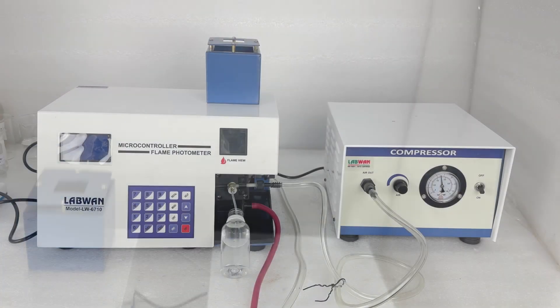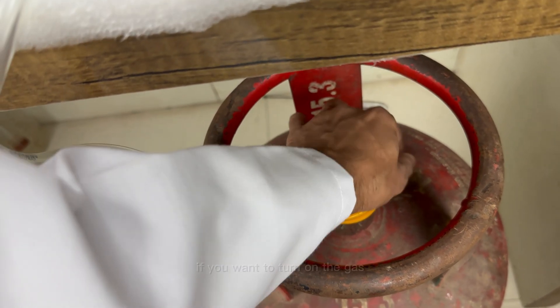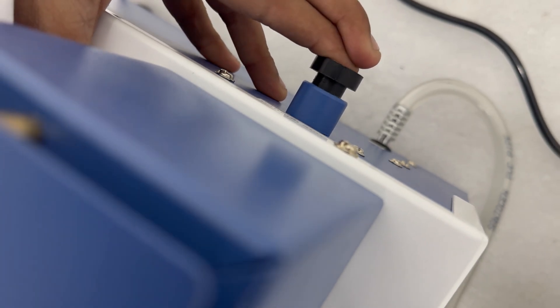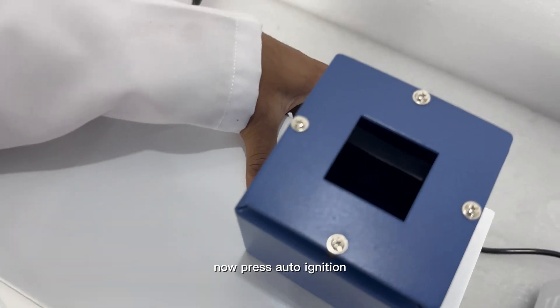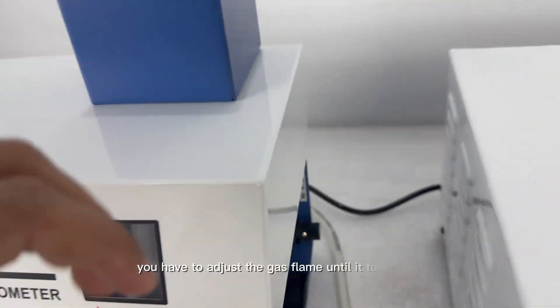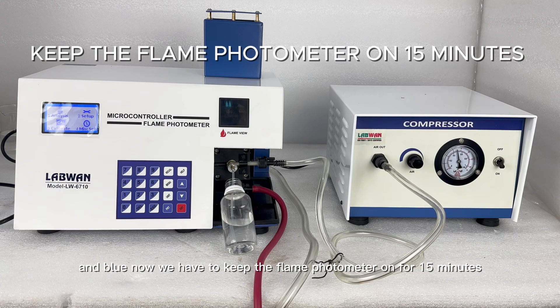Now turn on the device. To turn on the gas, use the auto-ignition by pressing it. Now turn on the gas, and you can adjust the gas with the help of this knob. Now press auto-ignition and you can see that our gas has started running in the flame photometer. You have to adjust the gas flame until it turns blue. Now we have to keep the flame photometer on for 15 minutes.